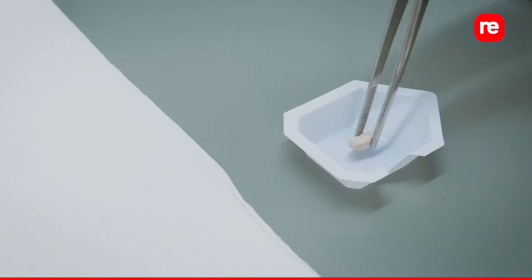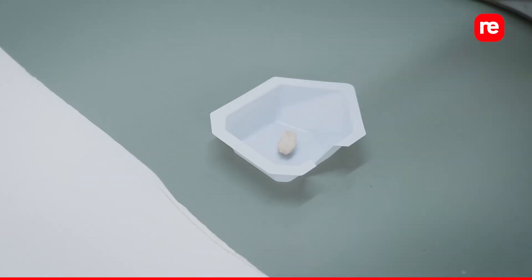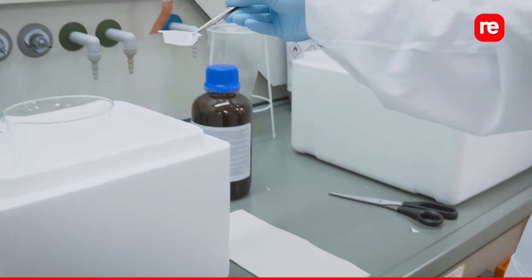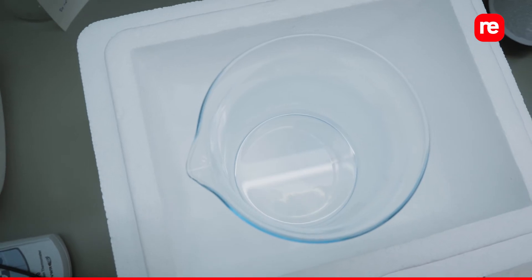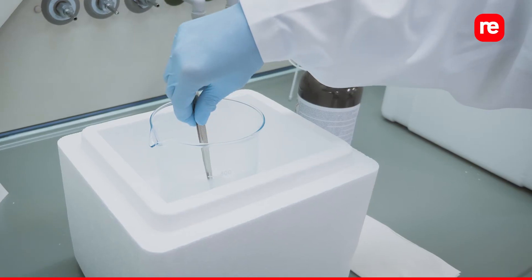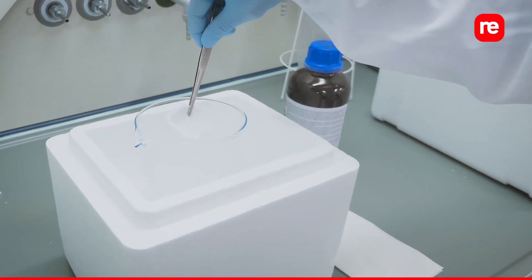Place the tissue on the tray and submerge it in the isopentane for about one minute. Retrieve the tissue and decant the isopentane from the tray.